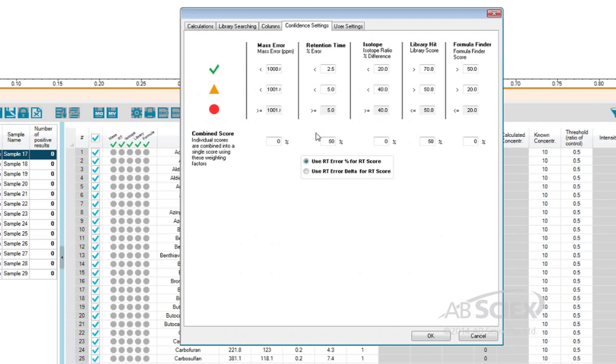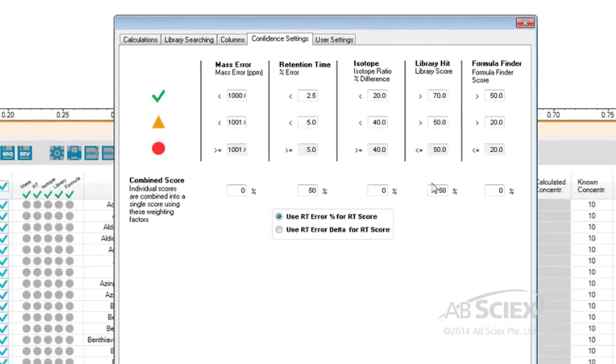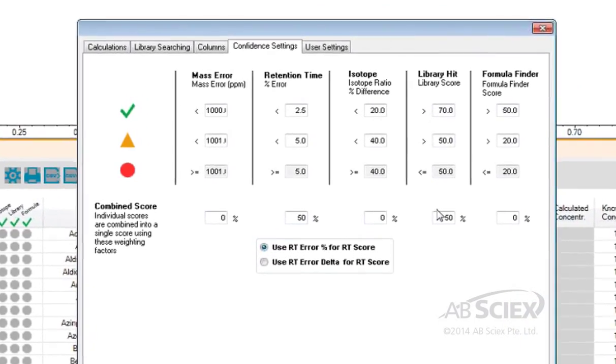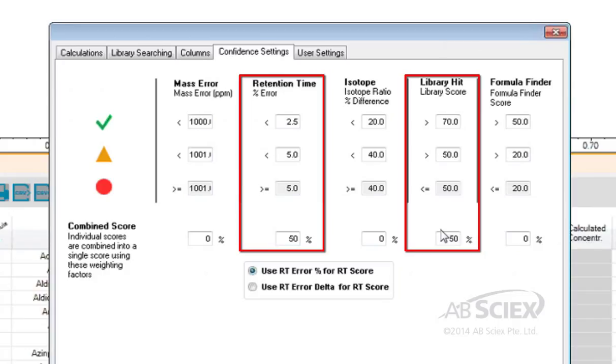For QTRAP enhanced product ion MS-MS library searching, we are only interested in the retention time and library hit scores. The acceptable scores entered here have been set up based on performance criteria identified in regulatory guidelines for retention time, and based on our experience with library searching acceptability scores.